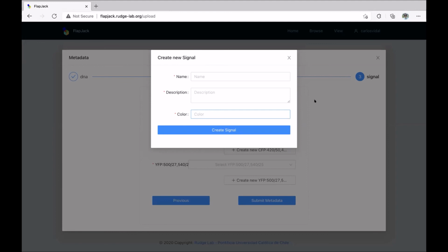And by the way, just to mention, this is just one type of data, the plate reader data, but as Gonzalo showed, there are other ways to upload data, and Gonzalo is going to show later via the Python package interface to the API or directly through the API. You can upload any kind of data that you like.